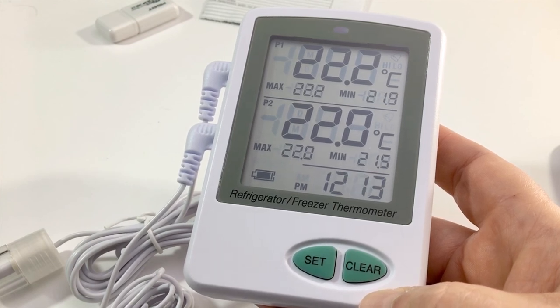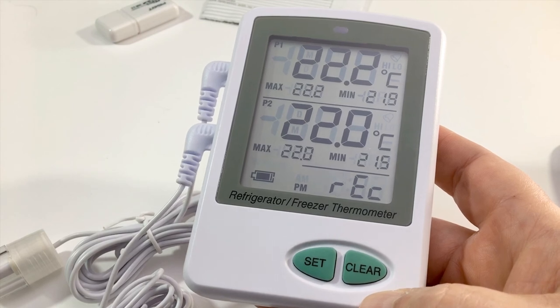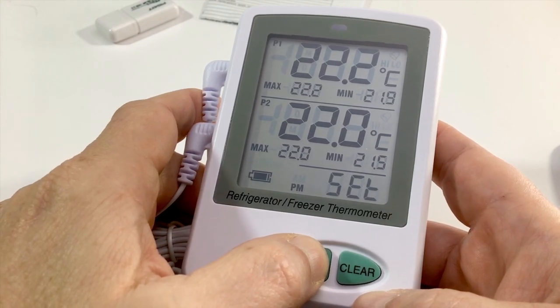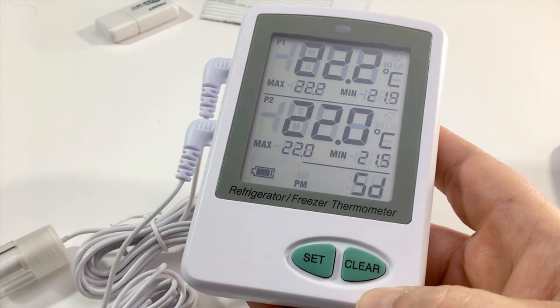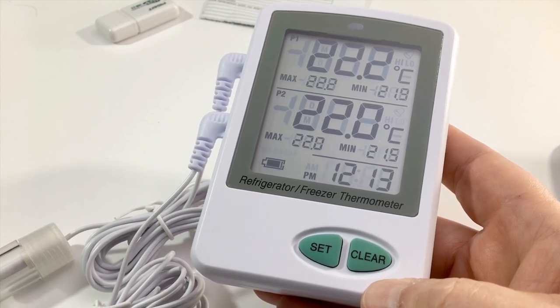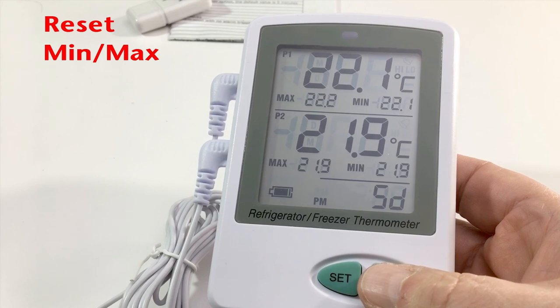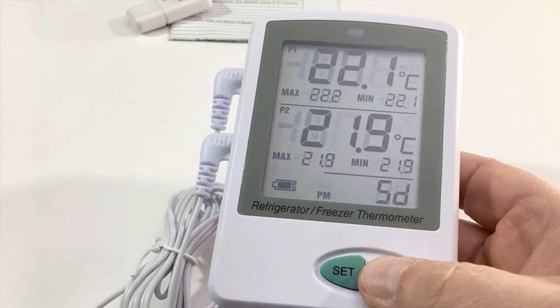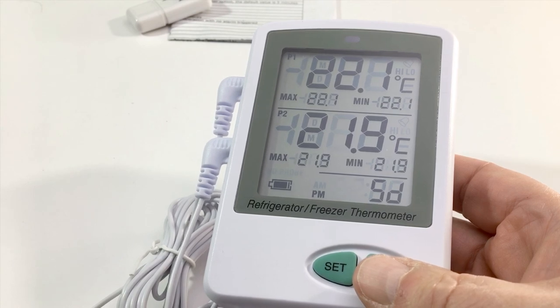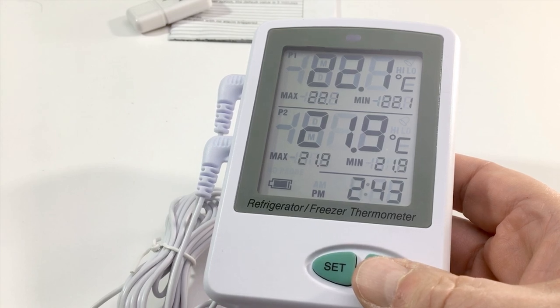When you are done recording or ready to download data — either via USB cable or through the SD card reader — you need to stop recording first. Hold the Set button again for approximately six seconds until 'OFF RECORD' shows on the screen. You can now safely remove the card or connect the data logger to the PC via USB. To reset the min and max stored values in memory, press and hold the Clear button until the min/max values display hyphens. The min and max values are now set to the current temperature for each sensor. This resetting closes the current data file and creates a new CSV data file.